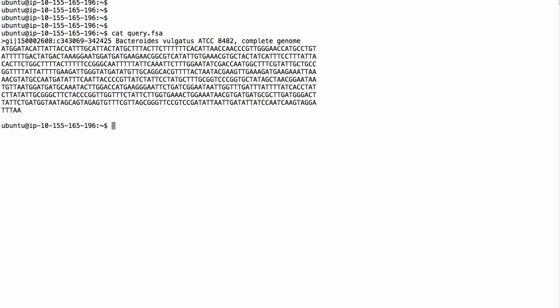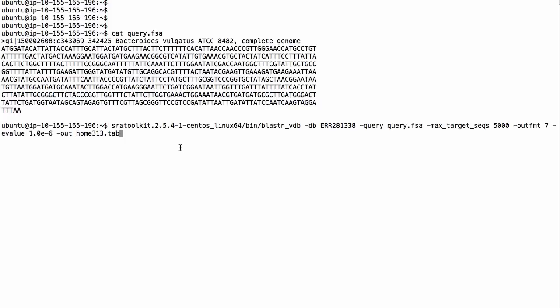I've copied over a query that is supposed to help us identify antibiotic resistance. I'm going to run these searches with some parameters I saved to a file. The database name is actually the run accession. I set max target sequences to 5,000 — that's 5,000 different runs I'll get results for. Output format 7 gives tabular output. I've set the E-value to 10^-6 so I'm only looking for very significant matches, and the output will be saved in the file 'home_313_tab'.